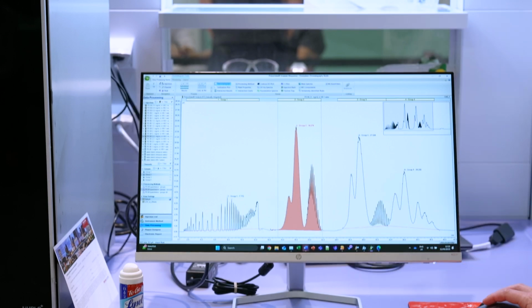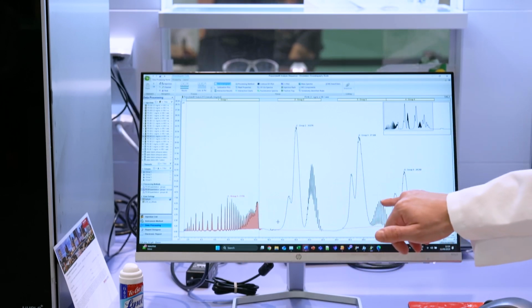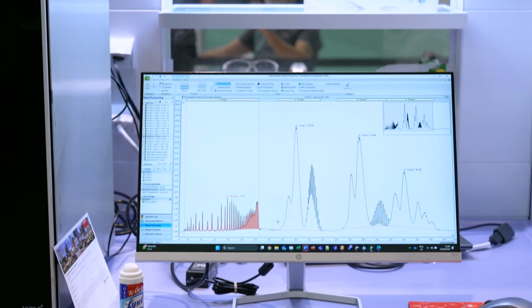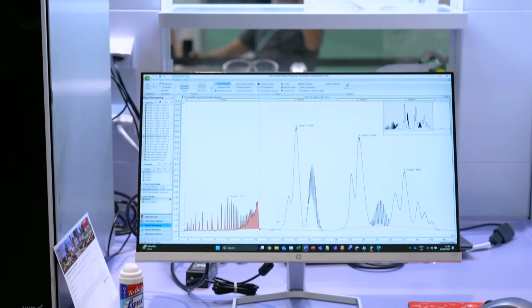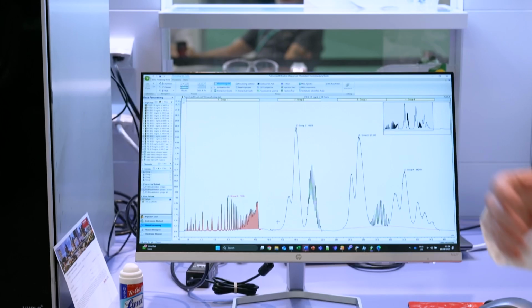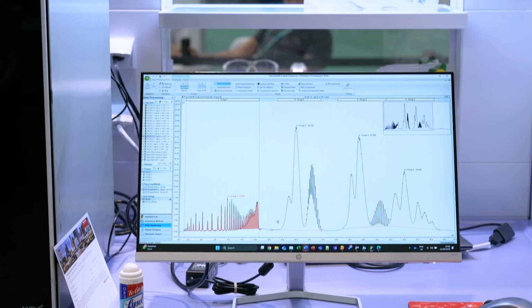So what we're looking for here is the different peak groups, and here we've got 4 distinct peak groups. With this type of analysis, what we're doing is looking at essentially the fingerprint: the relative areas between these 4 different groups. From this, when we're looking at different batches and different lots, we can do a comparison, so you can do some good lot-to-lot analysis and make sure nothing's changing in the manufacturing process, and make sure all the impurities are noted, along with any changes.